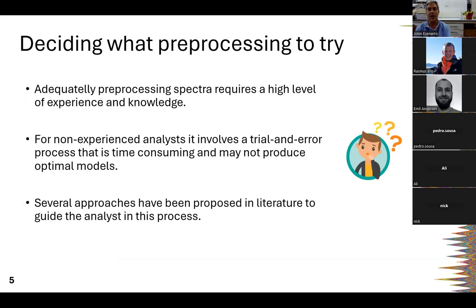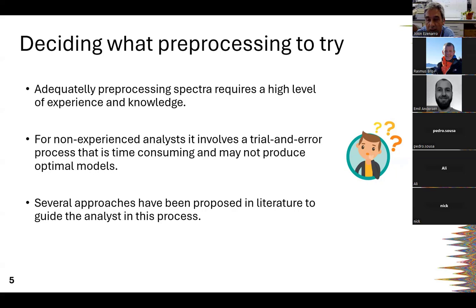The big question is: how do you decide what preprocessing to try, or what combination to try? This requires some experience and knowledge of the data and the effects that may be present. For people without much experience, the easier approach is just trial and error — trying different preprocessing steps and combinations and checking the final model results — but this may not produce optimal models.